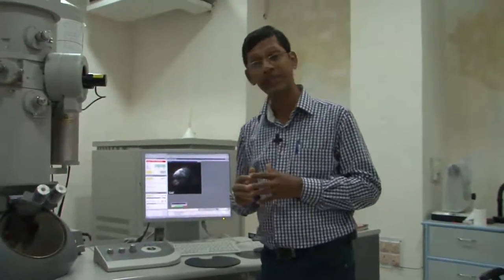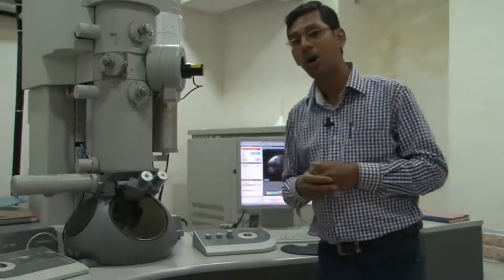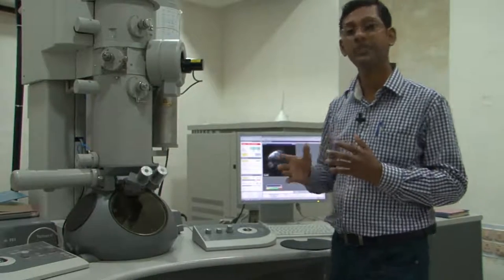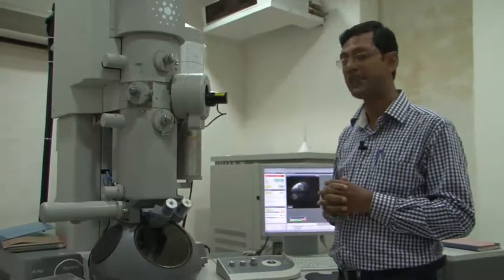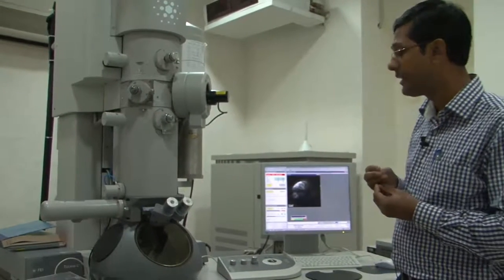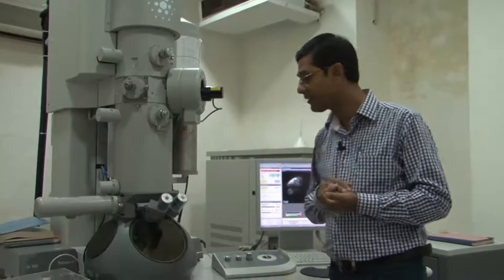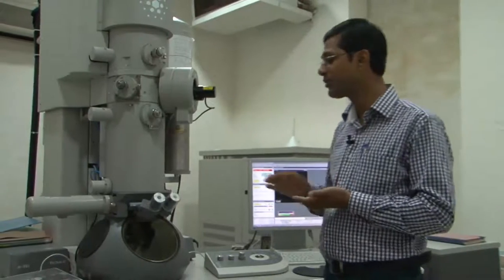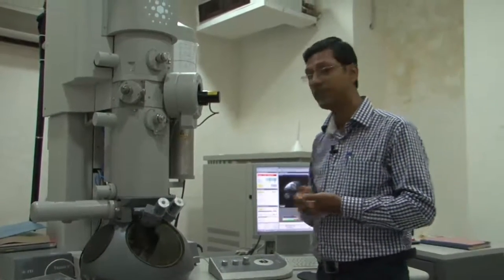over the time scale, as per the resolution of the camera, the sensitivity of the camera, and also the exposure of the camera; all have been developed to the optimum level. Nowadays we can have a very high resolution camera which can even grab high resolution images at the exact resolution that you see on the screen. But still many people use both imaging systems for day to day work.